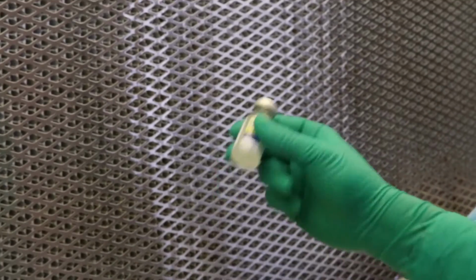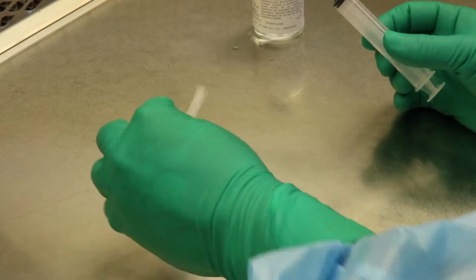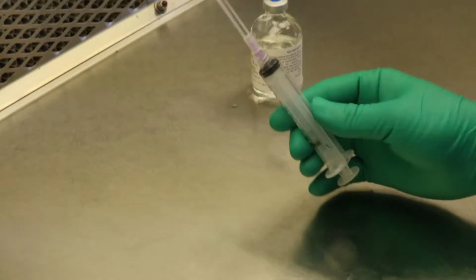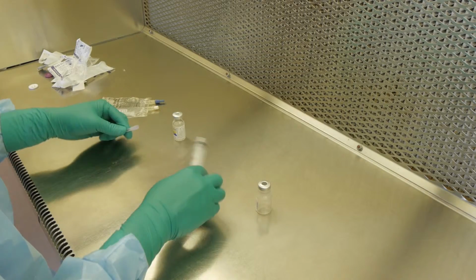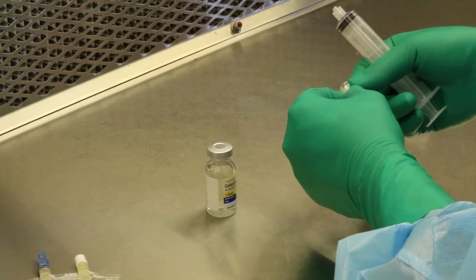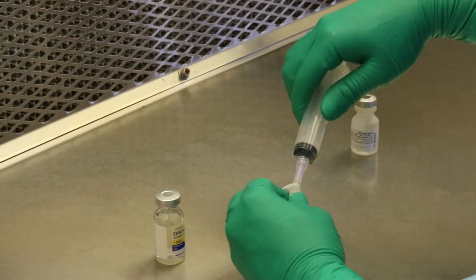Shake the vial until all powder has been dissolved. Now take a new needle and connect it to your syringe and draw up the antibiotic solution and inject it into the IV bag.